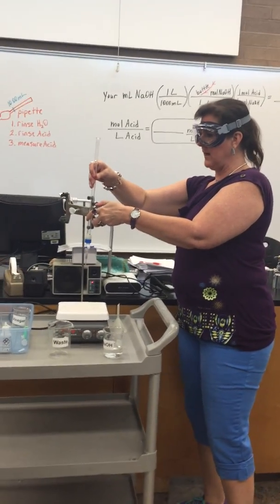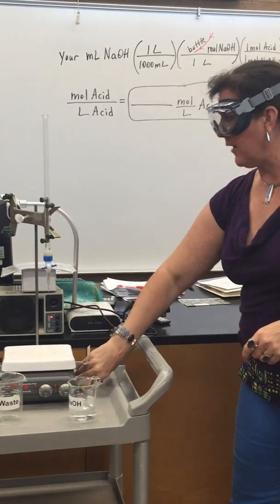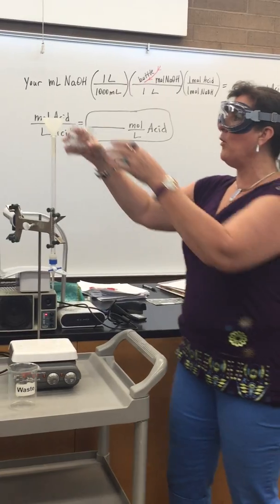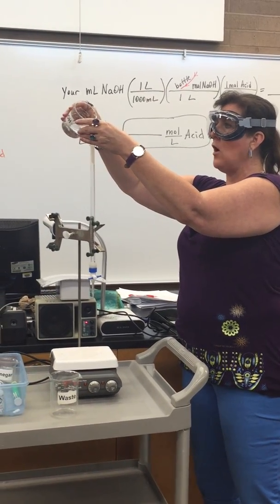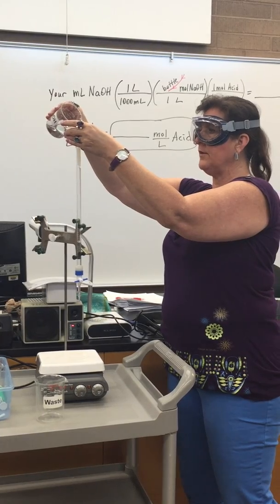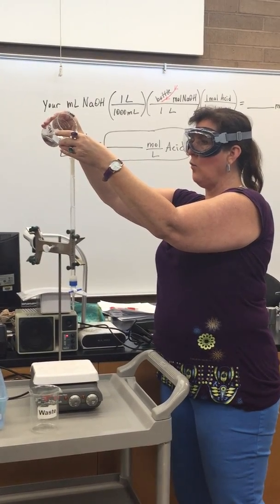Now my burette has been coated with sodium hydroxide and I'm ready to fill it up. We're going to clamp it one more time, make sure it's secure, make sure it's closed. Grab our funnel and the sodium hydroxide. Pour slowly so you don't overfill it. We're going to fill up to the top, close to zero or about one.